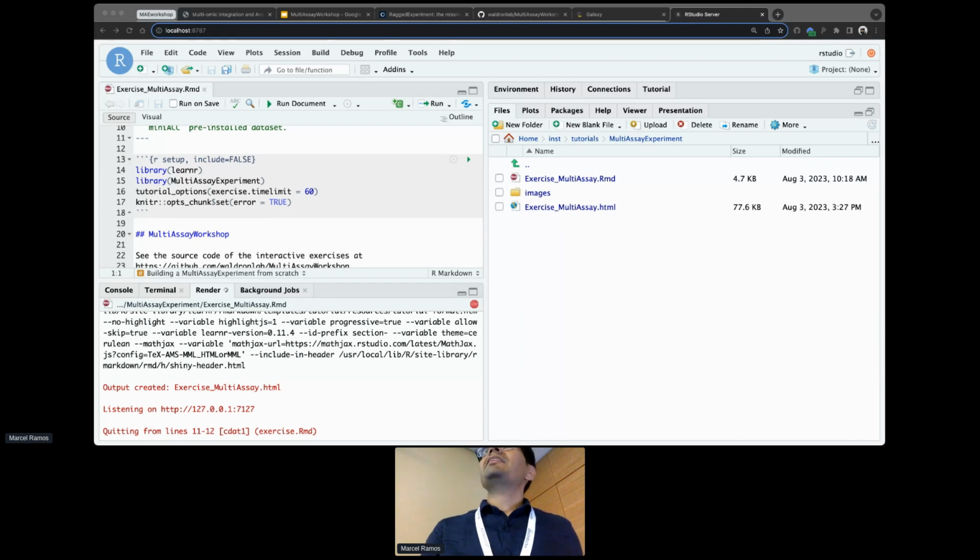Well, what we recommend is to have just one principal colData rather than multiple colData for each experiment, just to keep everything in one place. But you could store stuff in the colData. It's just that our interface doesn't really interact with the colData in those experiments.